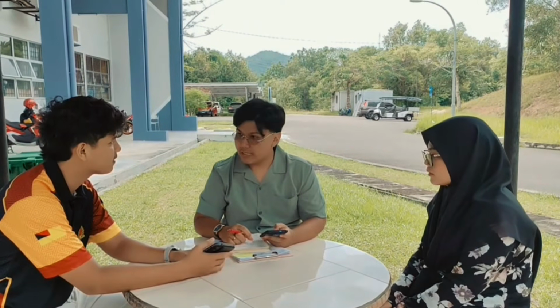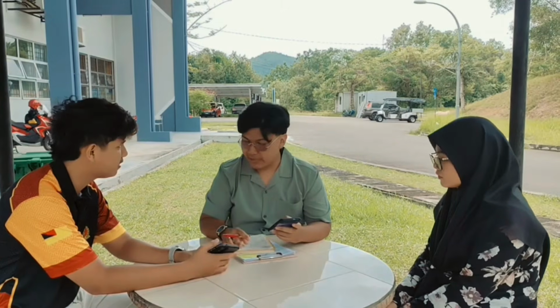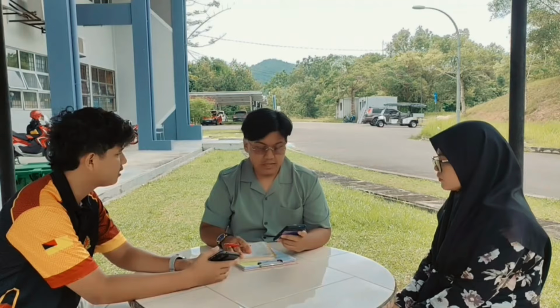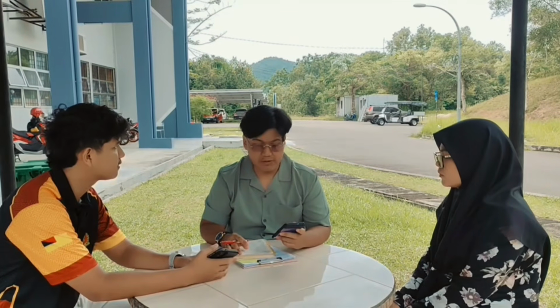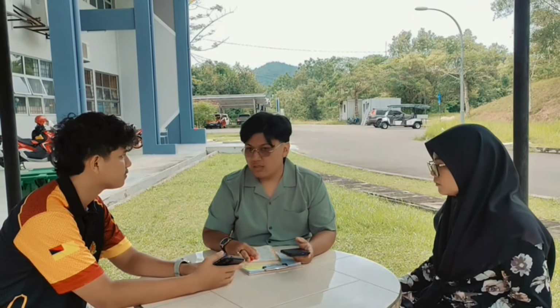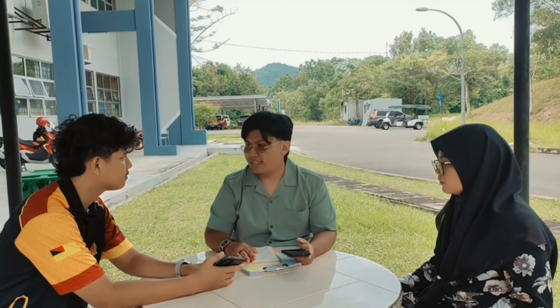Oh, like that. Yes. But if you want to run the procedure, you must know about the precautions. There are 4 precautions. First, we have ensuring purity of precipitate and avoiding loss of sample to prevent chemical hazard. And last is controlling environment variables such as light or moisture. But for the calculation, I don't know how to do it. If you want to know, you can ask Afrina.